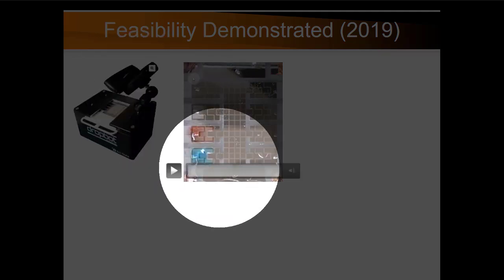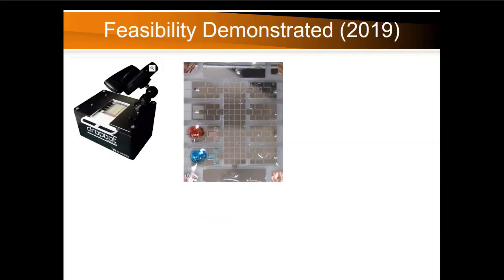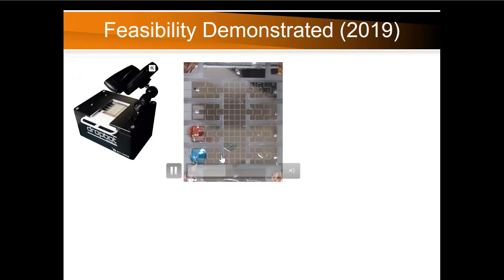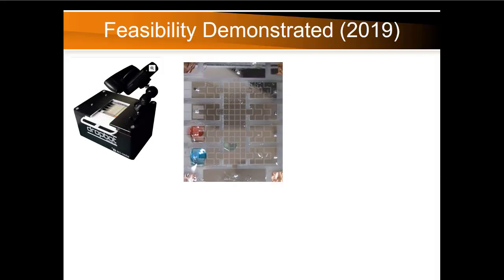So this is taken with this webcam, right? And now here, we're taking a droplet of the blue and a droplet of the red, which contain different DNA pieces. We mix them together on the device. You can see that the mixing scheme we chose here was not necessarily great because the droplet keeps splitting in this case, right? So we now picked a better actuation scheme. But here, this can control up to 120 different electrodes.